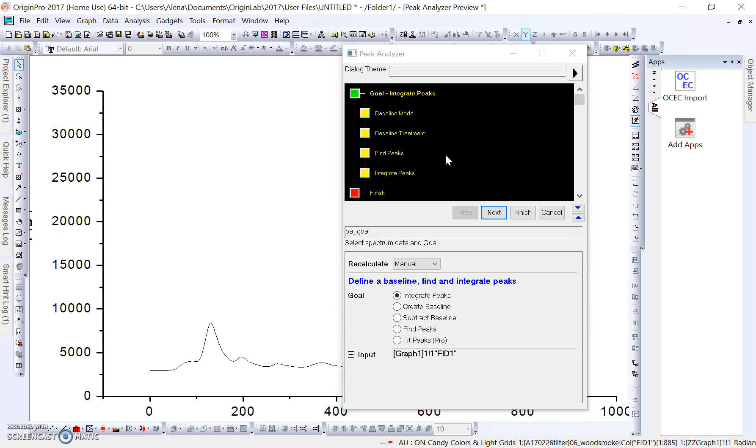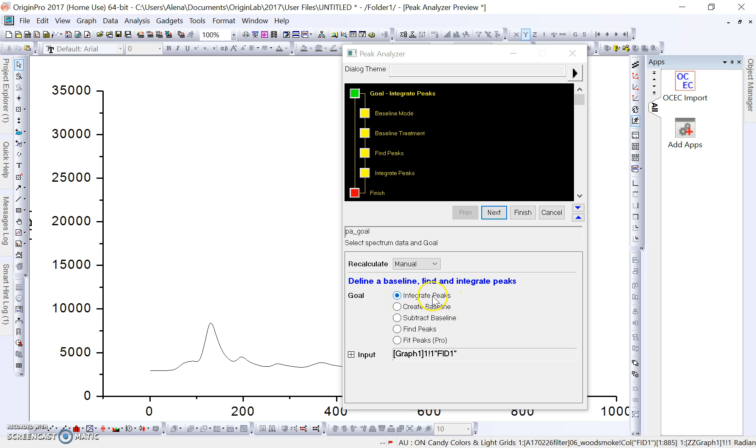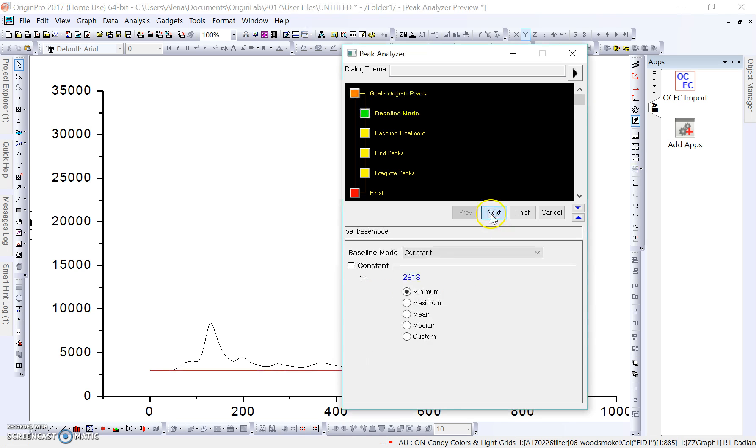This opens up a little peak analyzer software thing, and the first box that pops up here is asking what we want to define our baseline as or what we want to do. In this case, we're just going to leave it as Integrate Peaks. We'll click Next.